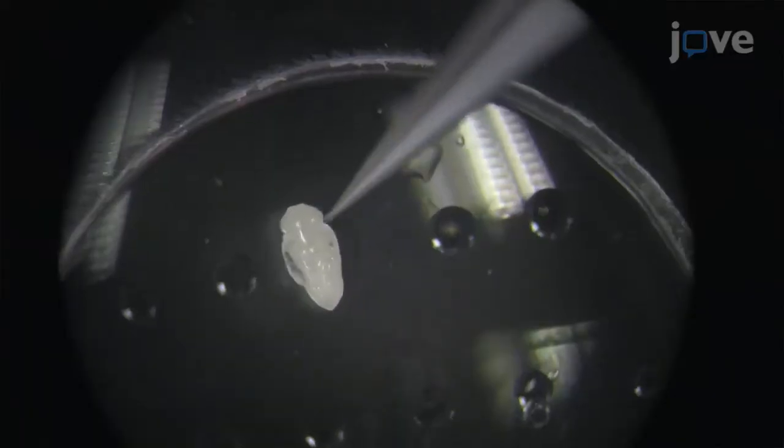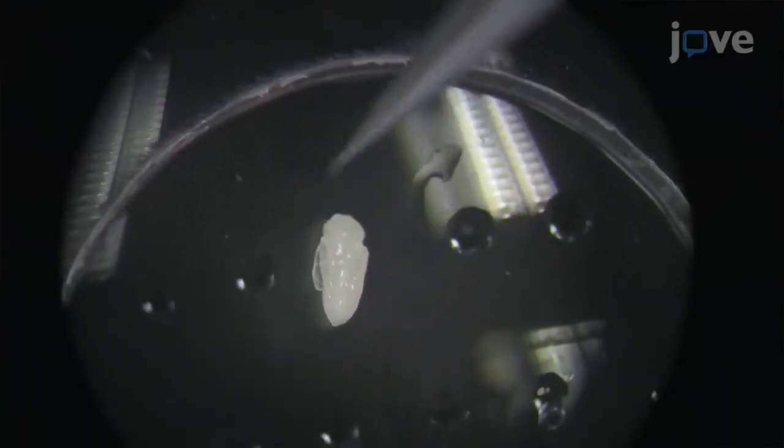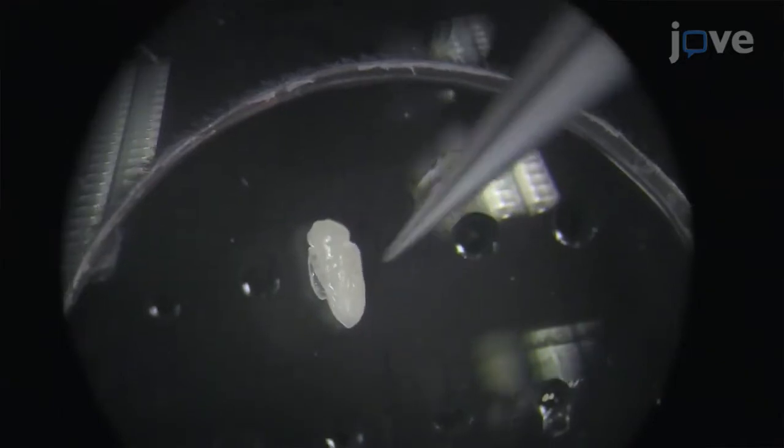All the steps can be performed easily after some practice. They demand precision. Visualization of this protocol helps achieving optimal results in a shorter time. The pupa dissection is complex.